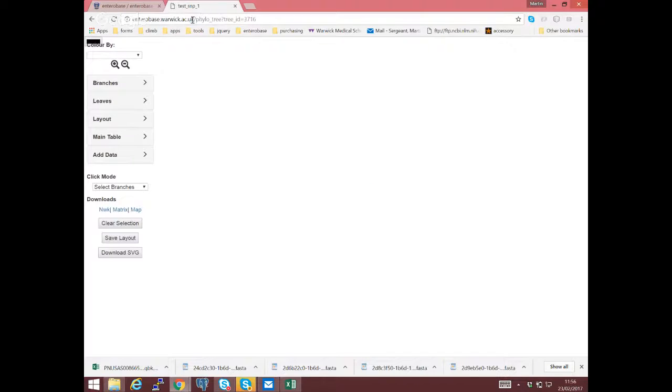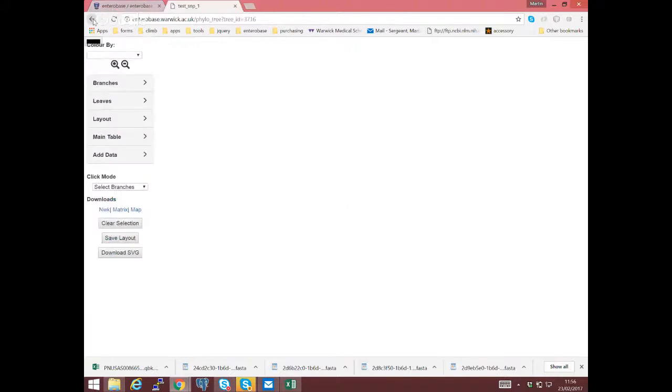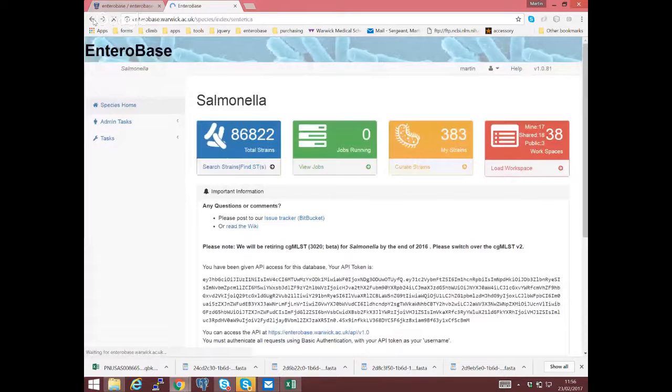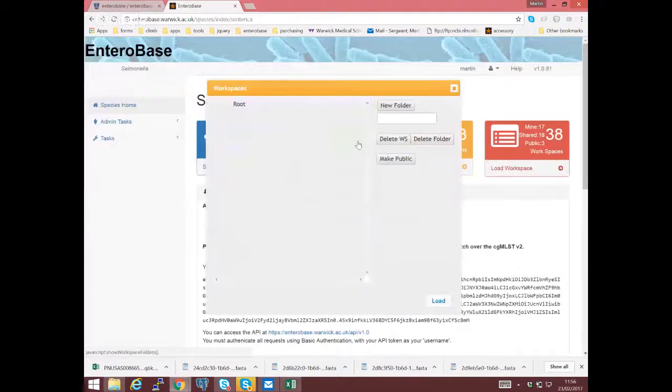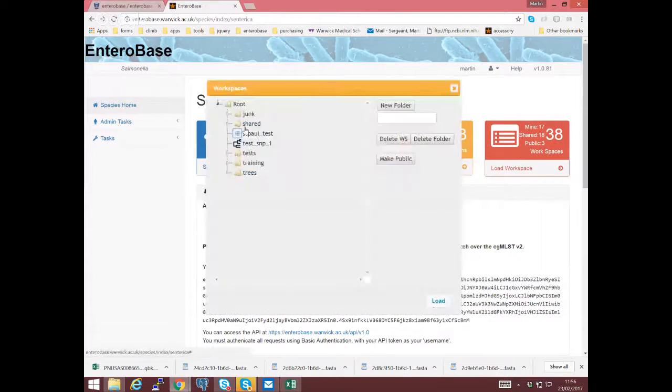Right, yeah. So this is actually the tree that I've created at the moment. So no wonder it's not ready. Sorry. The one I created last night, I should name them better, shouldn't I? Is actually in training and support test. That one.